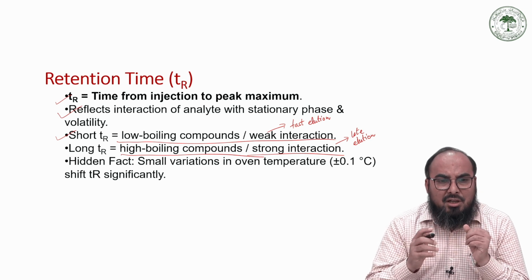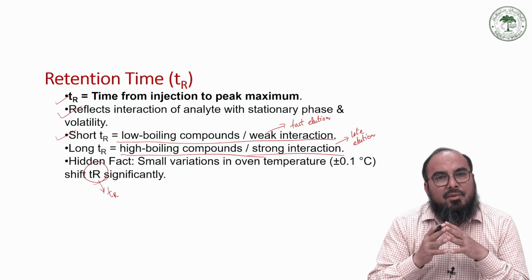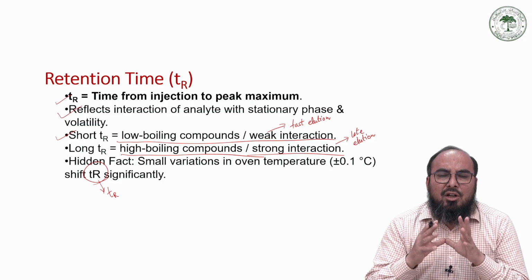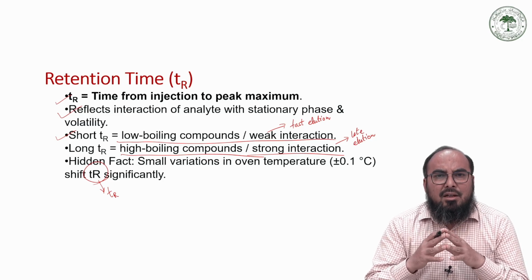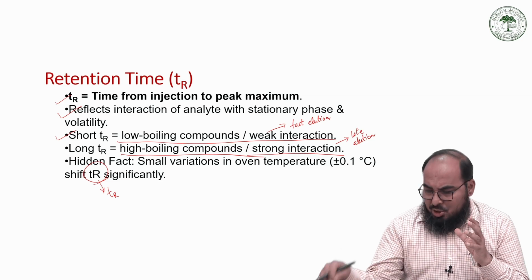Column temperature increases or shifts the TR. It is simply this, where R must be a subscript here. So you have to look for this. TR gives you a lot of information about the probable working, or about the probable ideality of your separation.